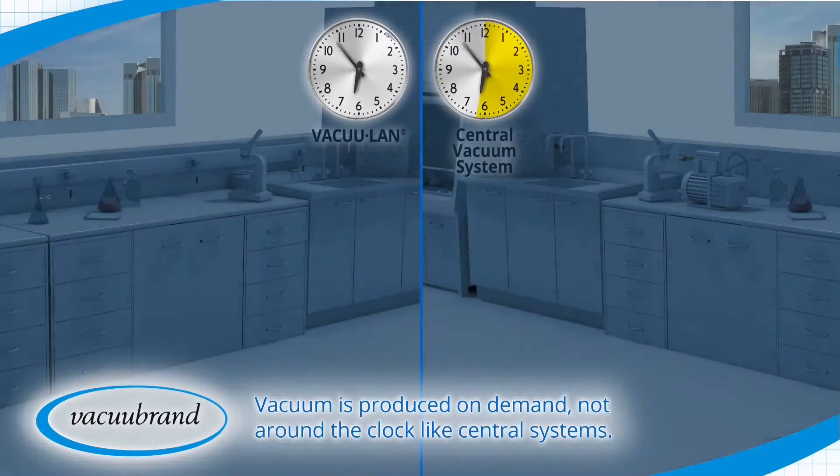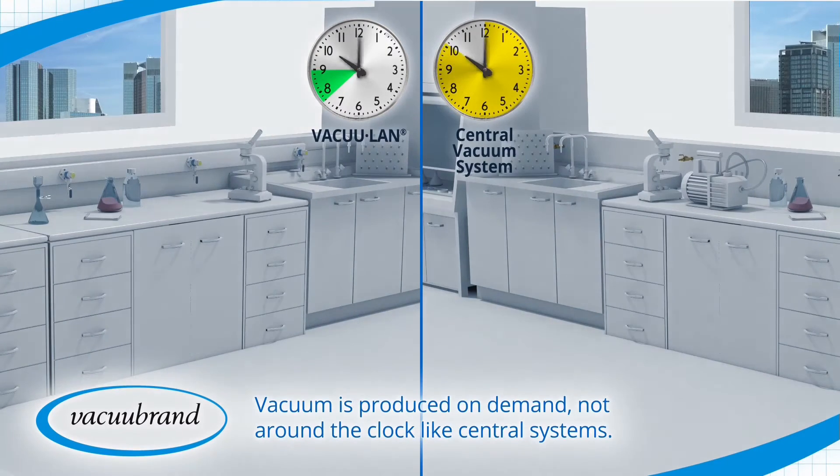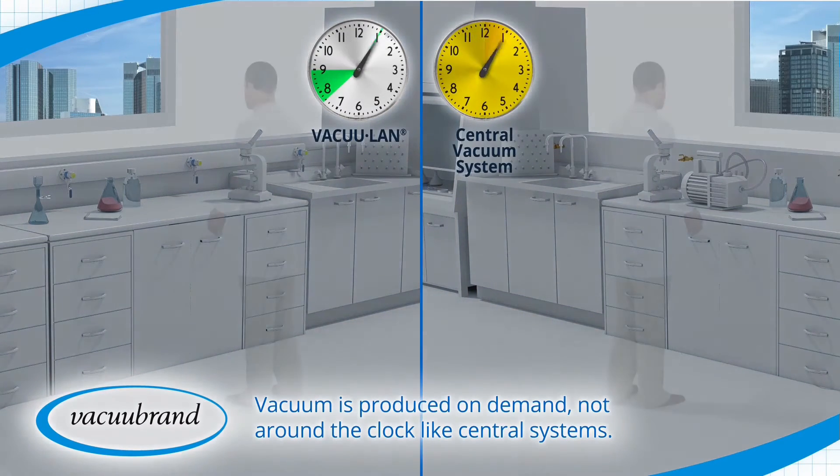Vacuum is produced on-demand, not round-the-clock like central systems, saving energy and extending service intervals to many years in most cases.